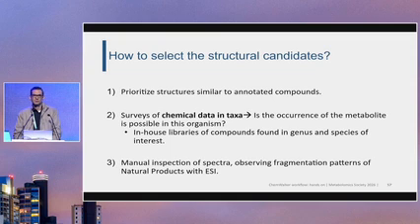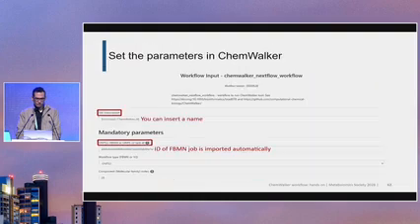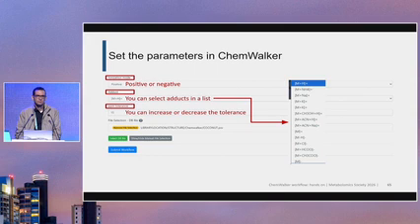Maybe Luís wants to complement, but we are basically basing it on the mass accuracy of the instrument. Generally, for all platforms, you usually try to guess based on the mass accuracy of the instrument. If it's a QTOF or an Orbitrap, you set the mass accuracy threshold based on that. That's not mass accuracy, what?